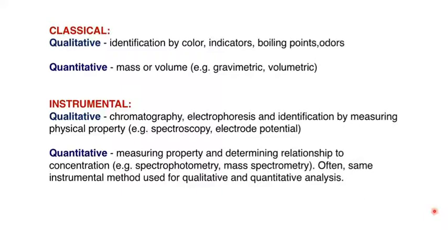Okay, well, for some reason, the species that I expected to be colorless or white is now suddenly yellow. Why is it now suddenly yellow? Or in a case that happened to me before, it was purple for some reason. It should have been colorless and given me a white crystal. It was a purple crystal. The crystal looked right, but it was purple. So I had to remove the purple color, but after that, it was okay. But sometimes it's like that. You just need to take an accurate record of what you're doing in your lab manual.